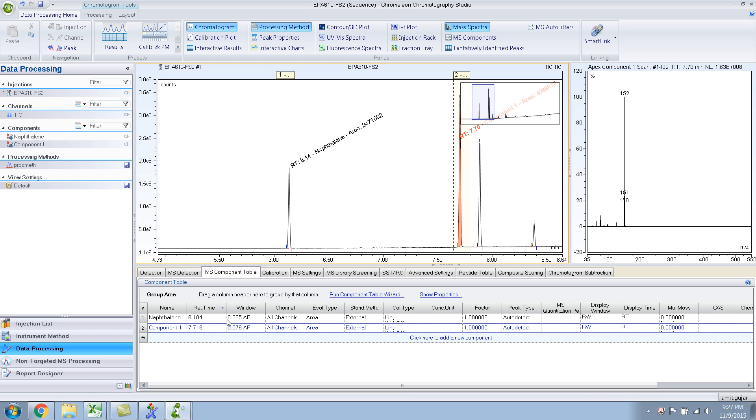So these are the two ways in which we can add compounds into the component table. Let me stop here. And then in another video, I'll show you a third way of adding compounds, a much more automated way.